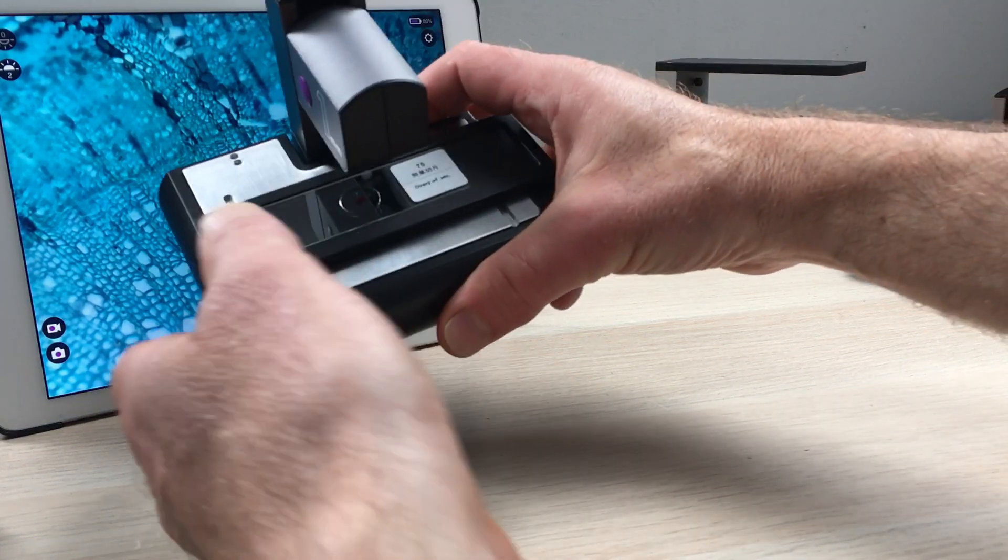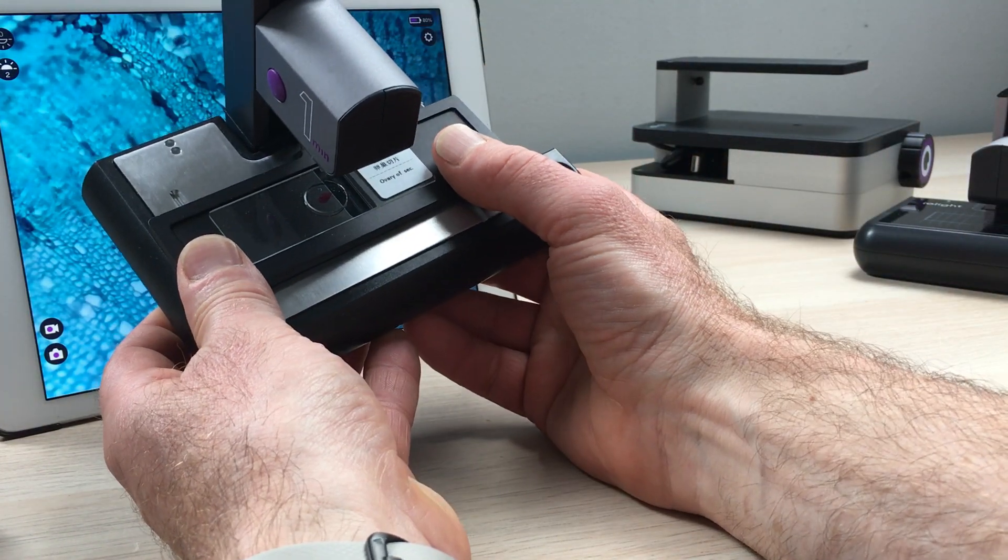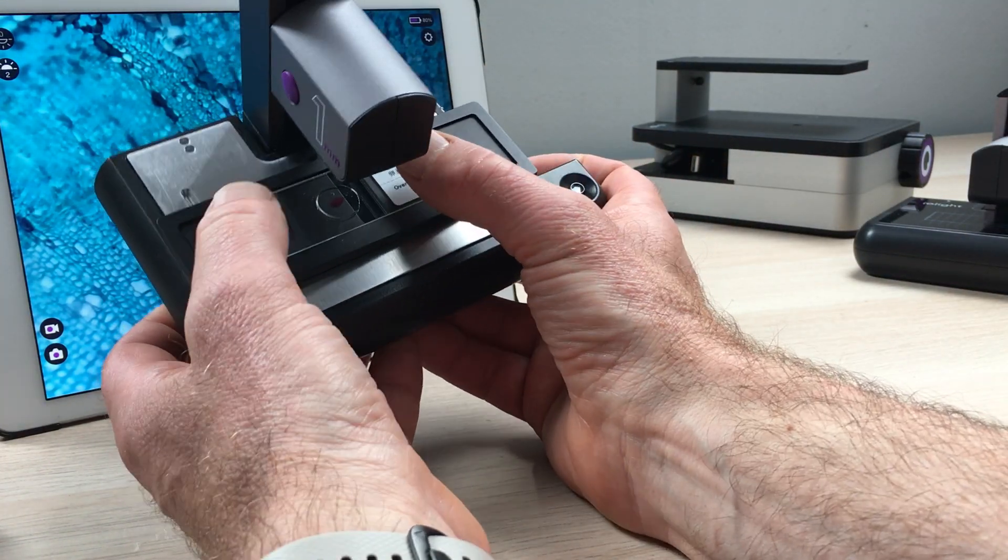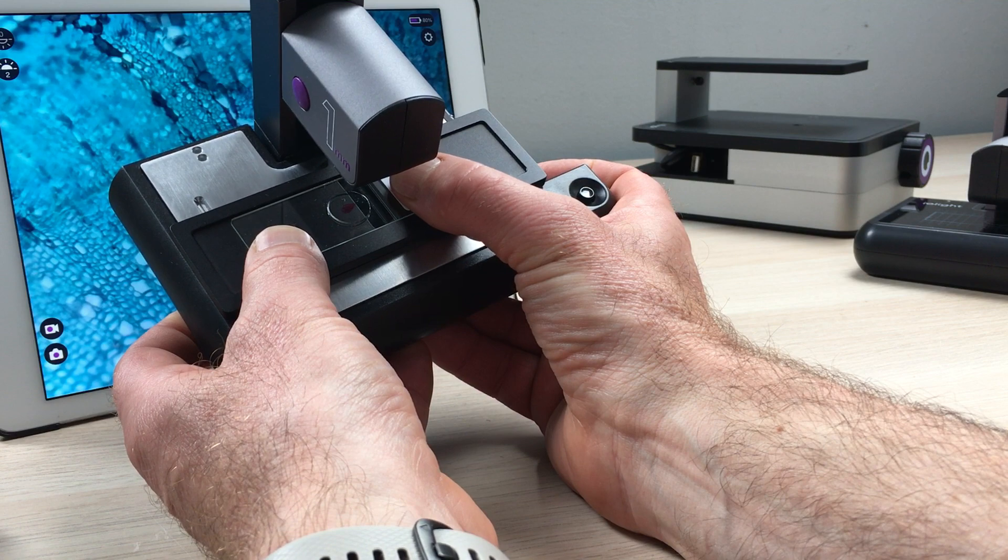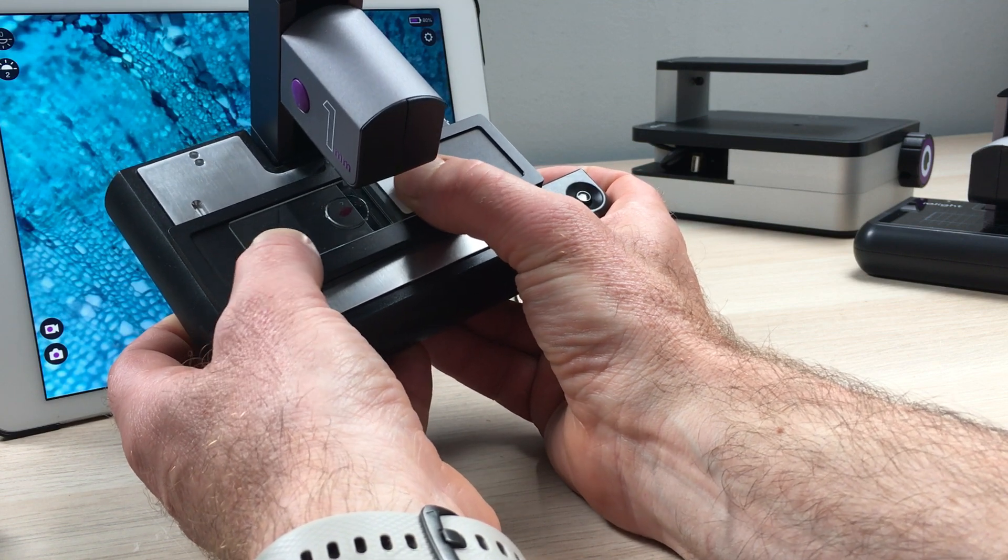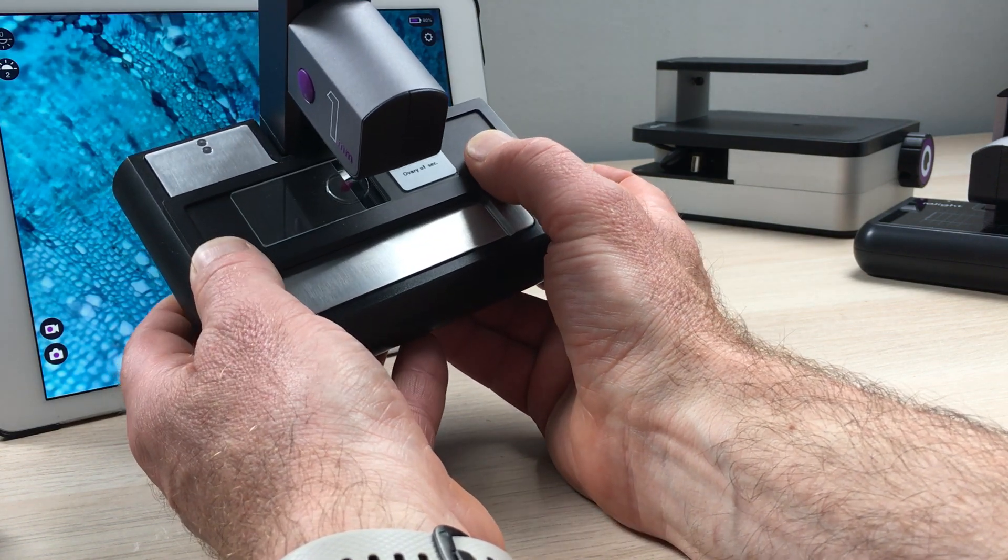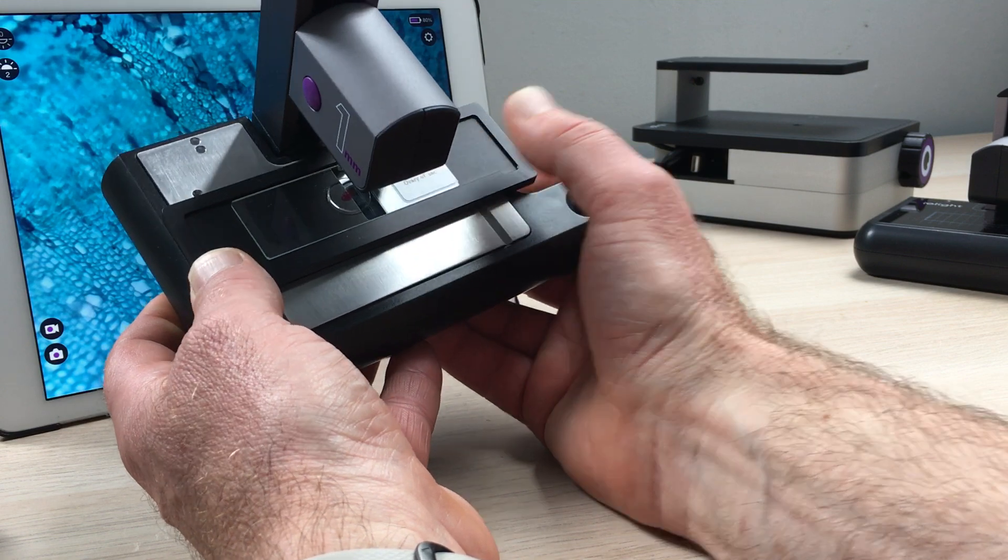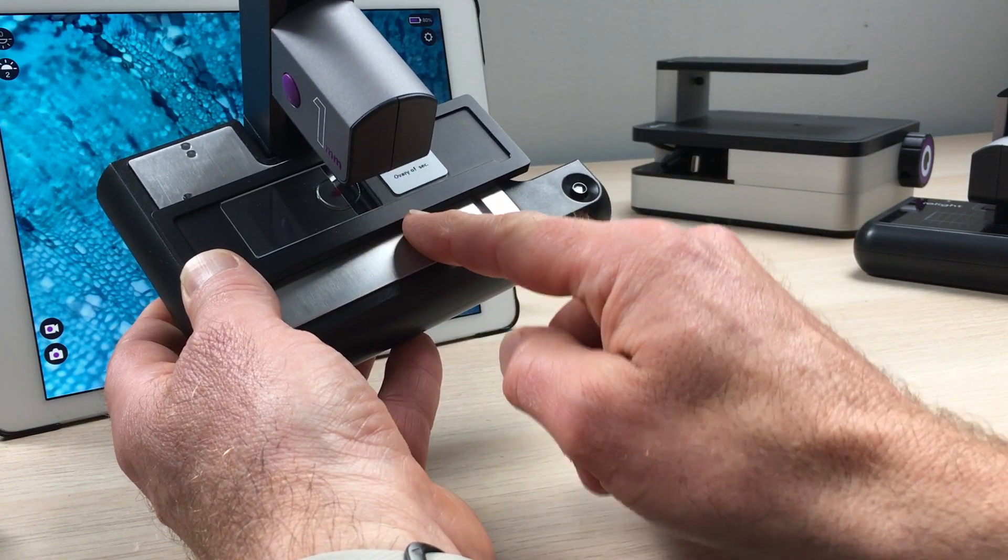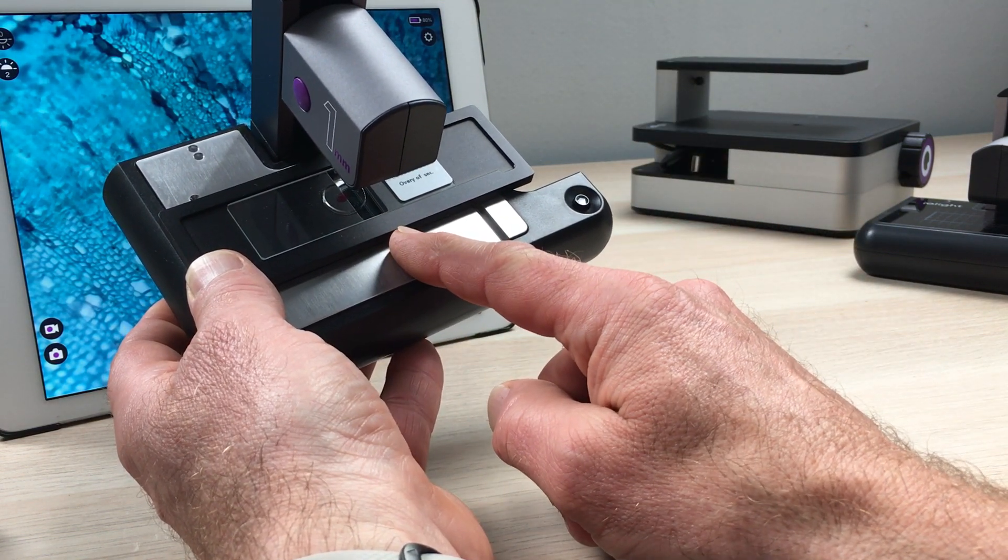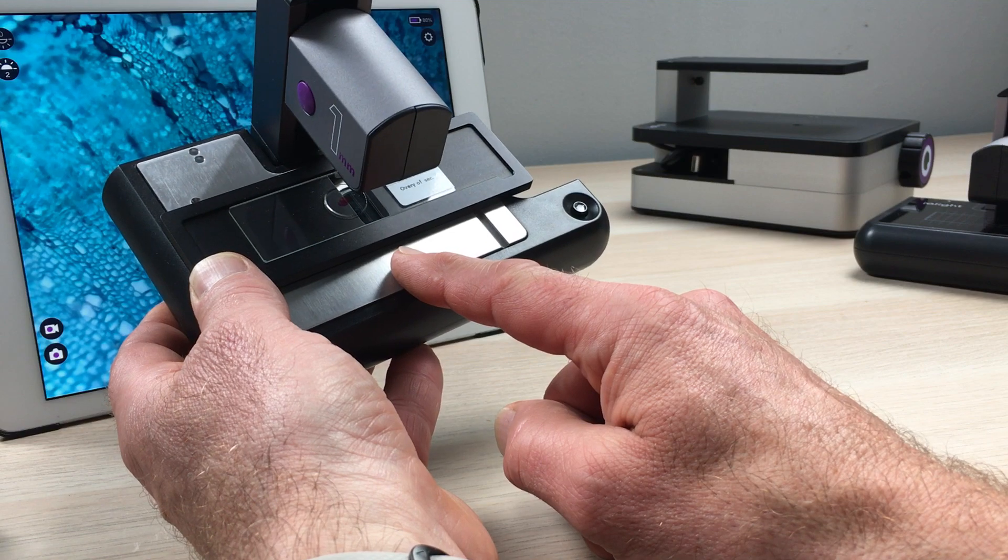This version of our portable microscope, we call it the XY microscope, has an XY stage, so you can put your sample here and you can slide it this way and independently slide it this way. This makes it nice and easy to count samples that are in a chamber like a McMaster's chamber or mounted on a slide.